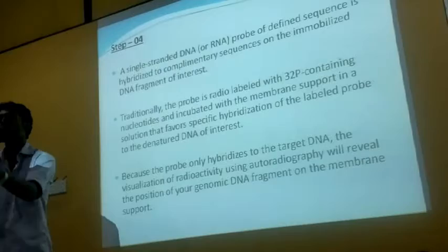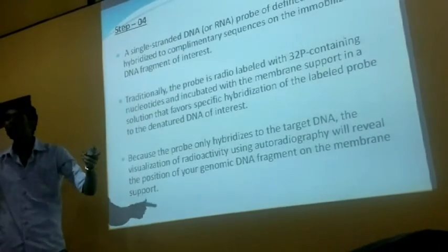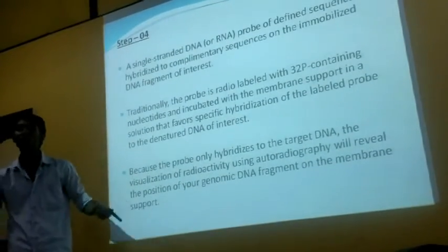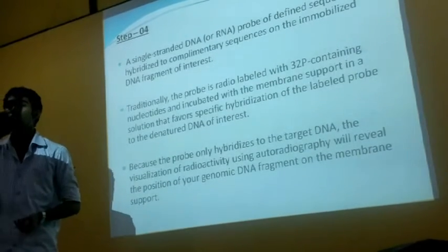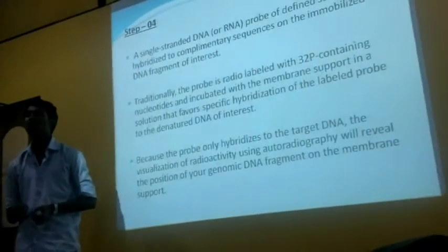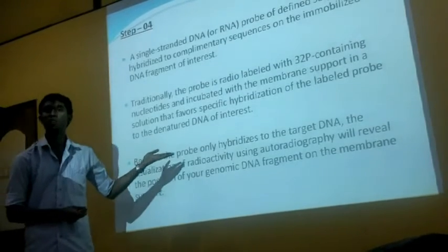You take an mRNA copy, and from that you derive a cDNA or complementary DNA which contains the probe, which is radio labeled, and then you send it to the nitrocellulose layer. Then it specifically goes and binds on the location where you have that insulin gene. So you recognize the exact position of that insulin gene in the nitrocellulose layer. That's what hybridization does.